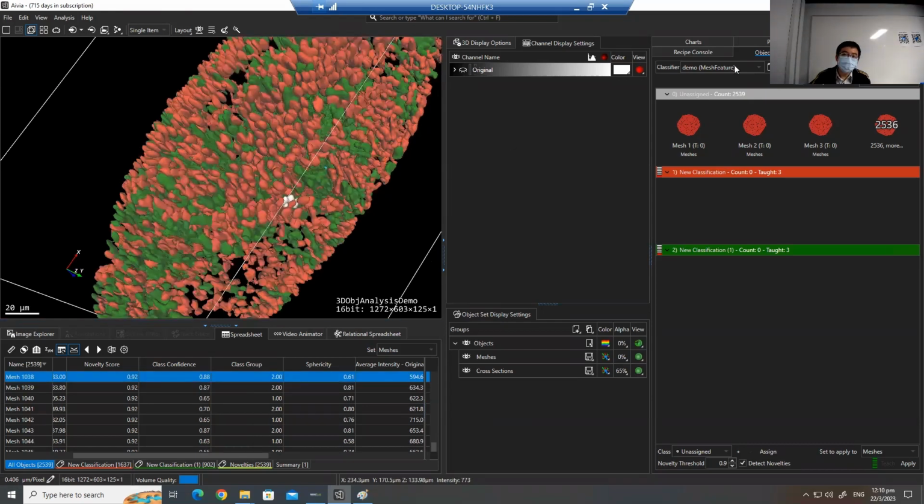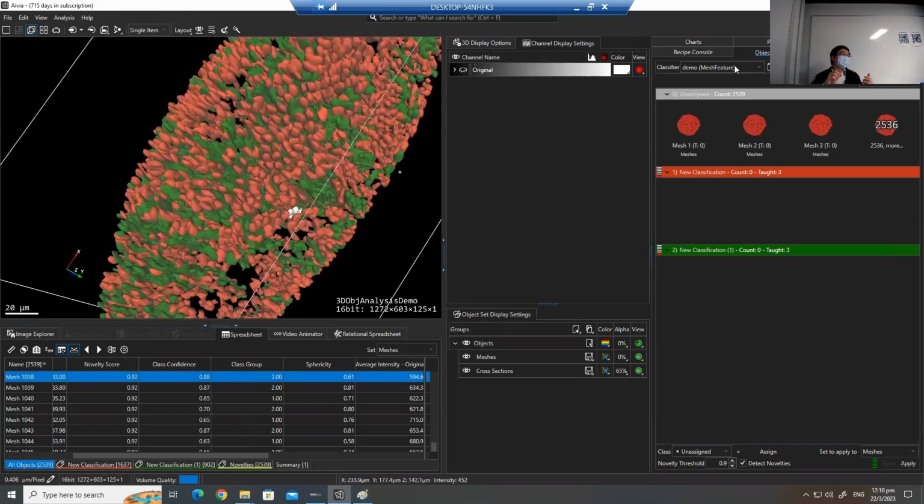And in the afternoon, we are going to cover 3D cells, 2D cells, and the neuron model, plus Cell Pose. Maybe some kind of batch processing.